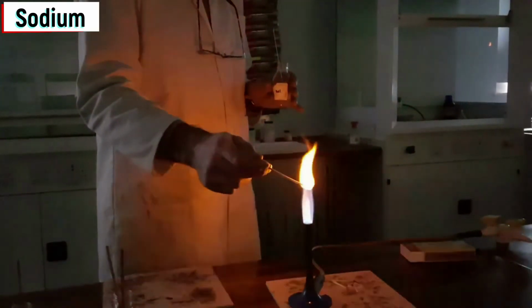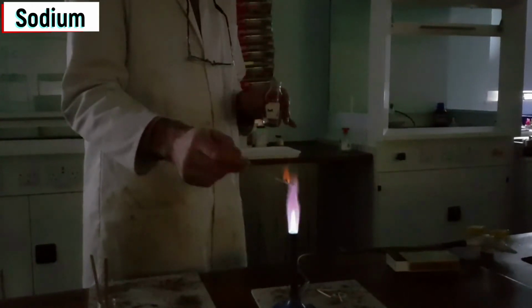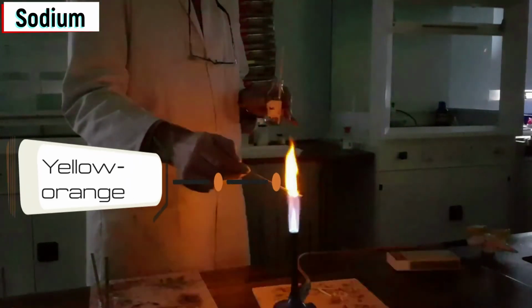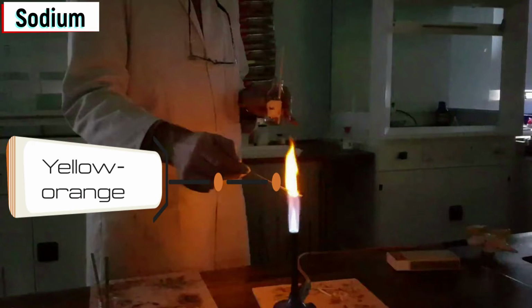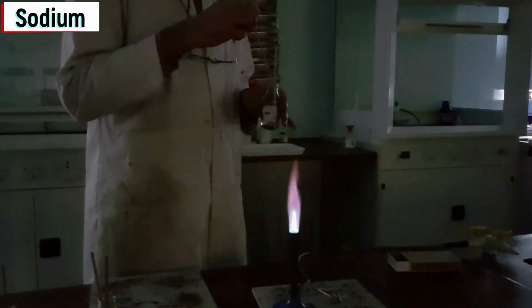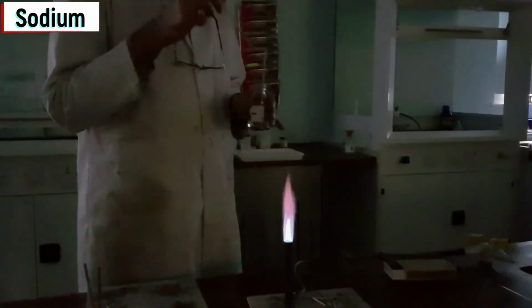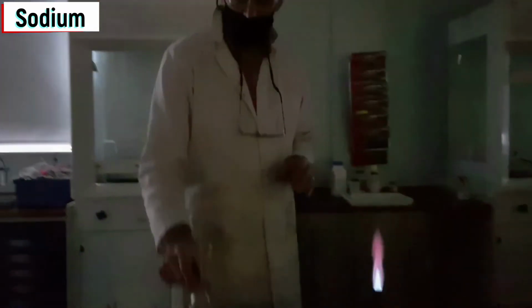Now we've got sodium, next one there. Sodium. Sodium gives us that very bright orange colour. You might recognise it from street lights. Now we've got to be careful here, because at some point the splint will start to burn, and at that point you will see the colour of the wood burning, which is a very bright yellow, the colour you would associate with things burning. So we must make sure that the colour we're observing is the colour before that takes place.